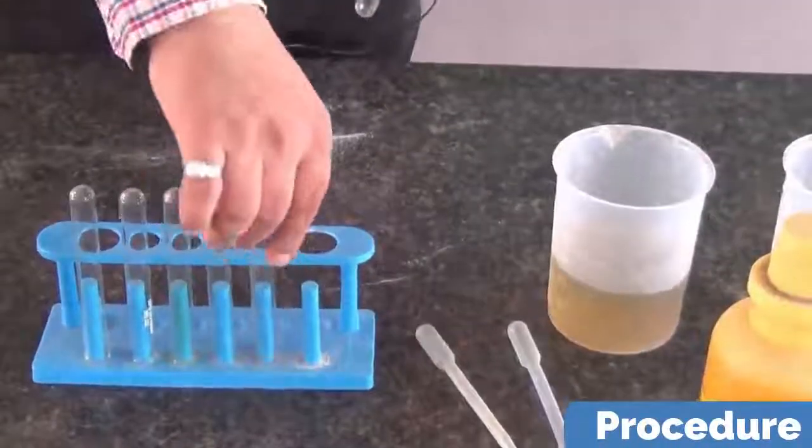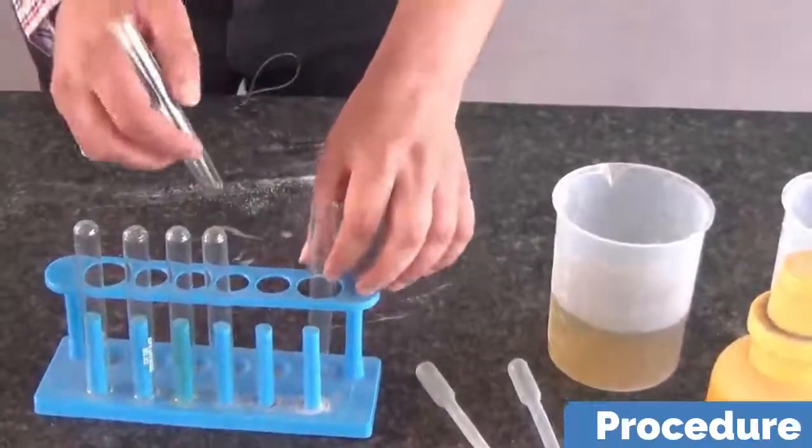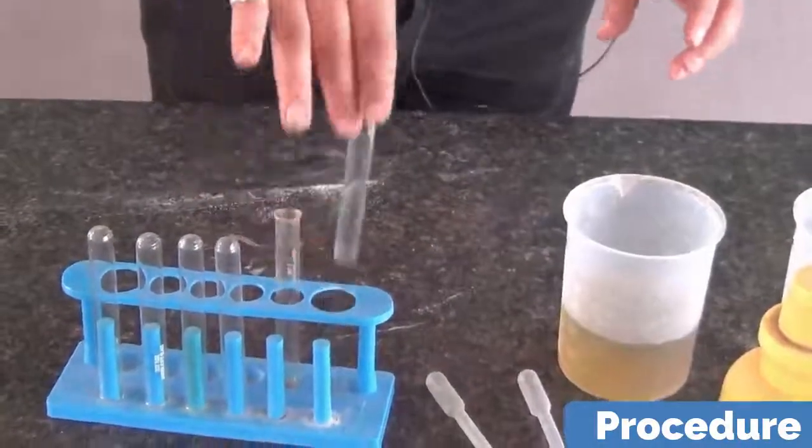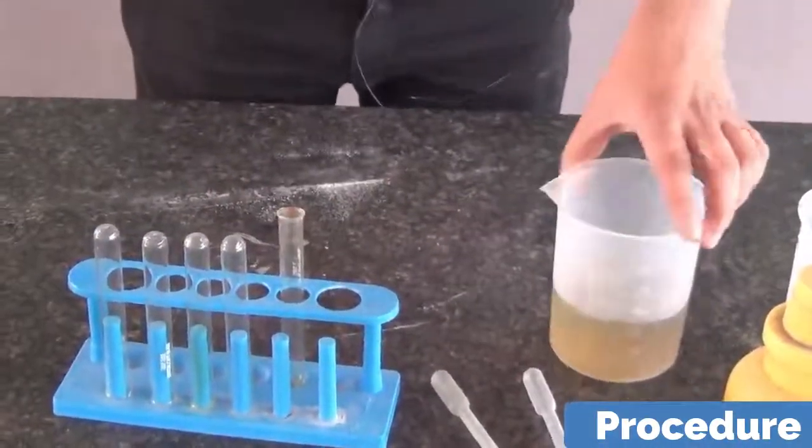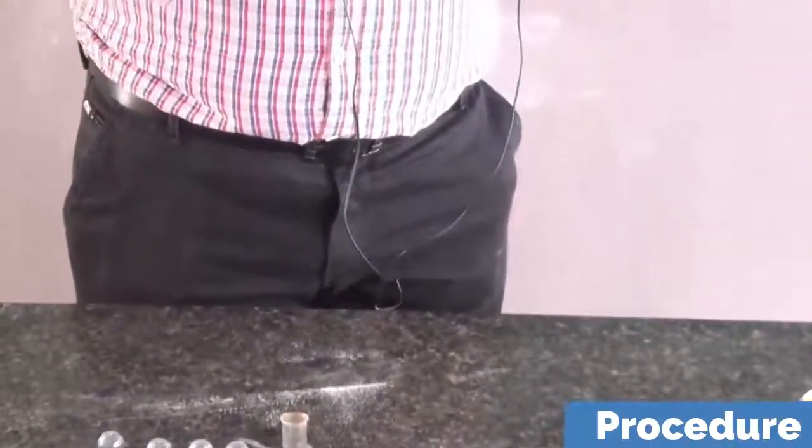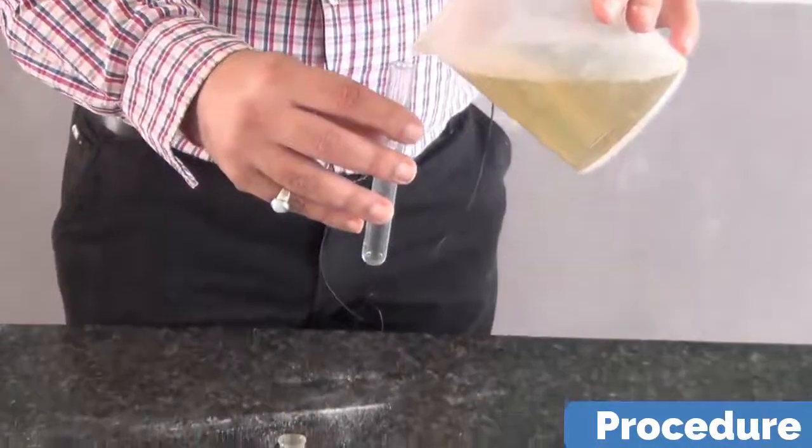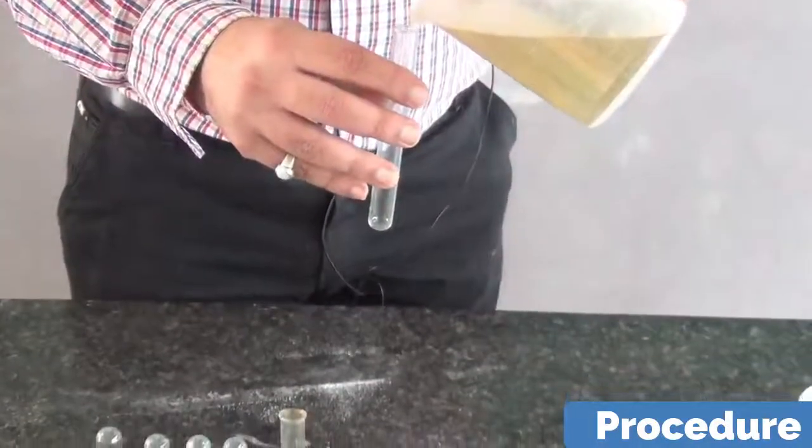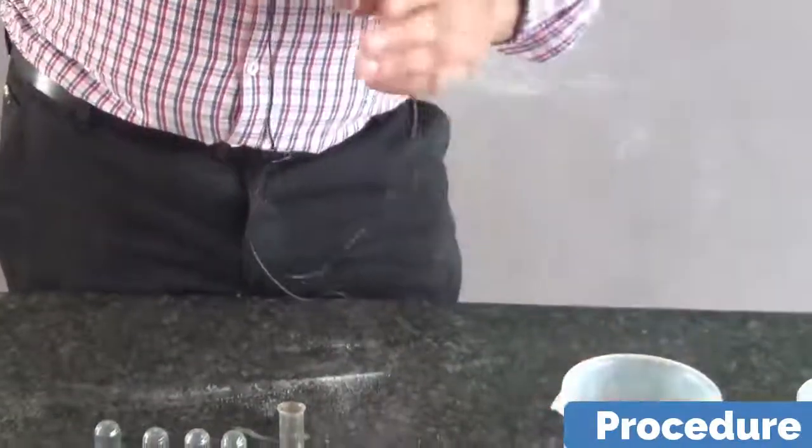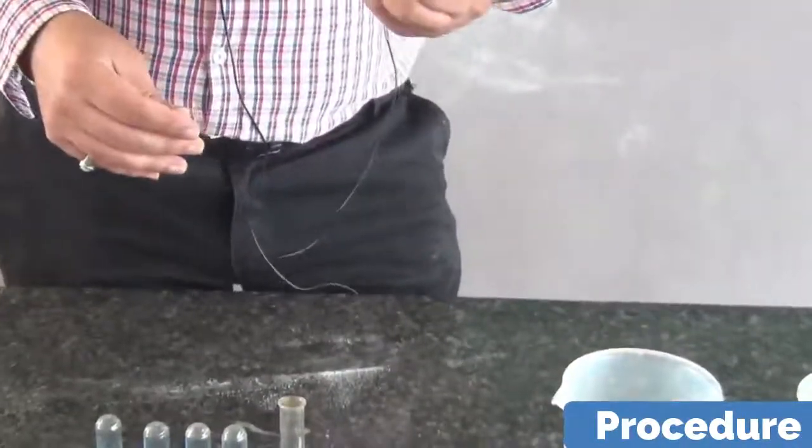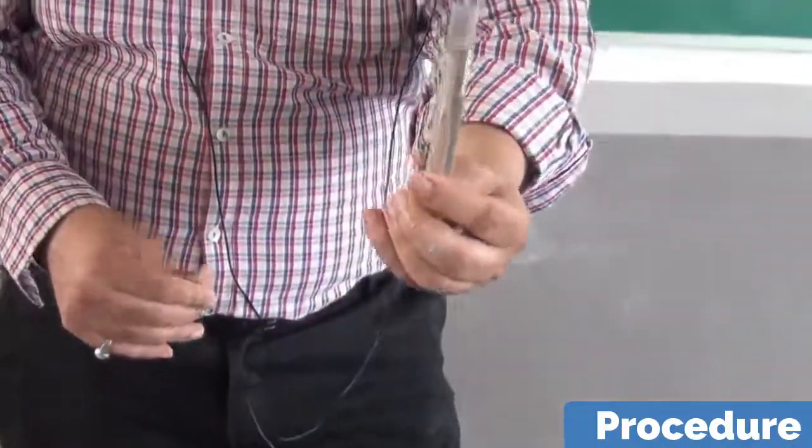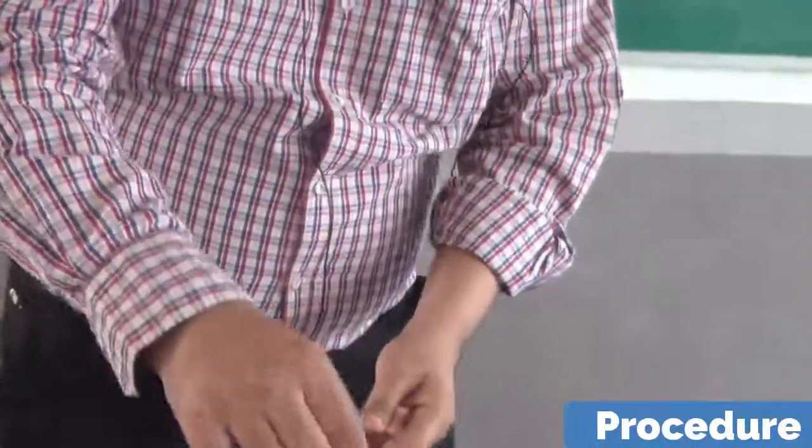We have two test tubes. We will first take two test tubes, place them in a rack, and then we need to add water. This is sample A water which has been collected from pond. Just see the appearance of water, it is yellowish in color. It is stagnant pond water, color is yellowish.